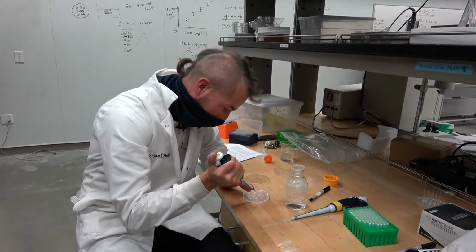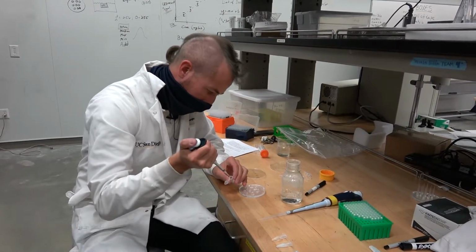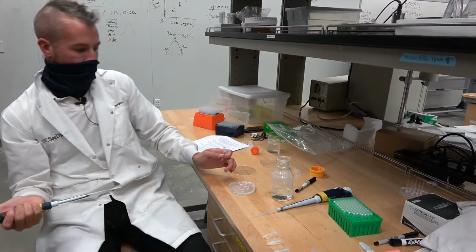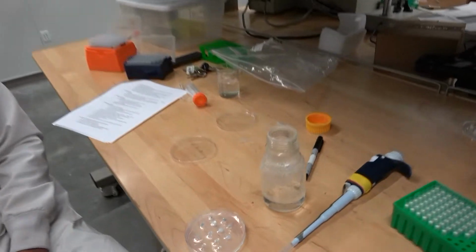Give it a mix. And in it goes. So you can see how these are starting to be filled up.